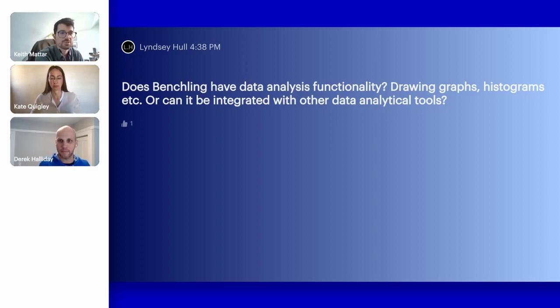So in our case, we use Spotfire just to query that warehouse, and Spotfire has very advanced statistics and other types of data aggregation and data wrangling functionality built into it, and it can also merge data between other sources. So we actually use both. For visualization and analysis that is specific to only Benchling, we use Benchling Insights. If it needs to pull other data in, then we use Spotfire with Benchling's warehouse.